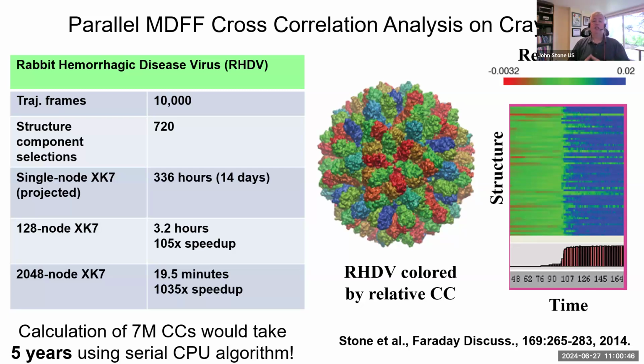So that's pretty amazing. I'm not aware of any of the other visualization codes that exist in this domain that can do anything like this. So this is a unique capability of VMD versus the others. I would say, you know, this example, while it happened to be orientated toward cryo-EM fitting and things like this, there are many things where we can use this functionality of VMD.